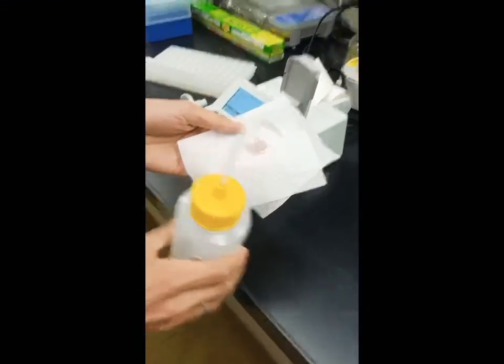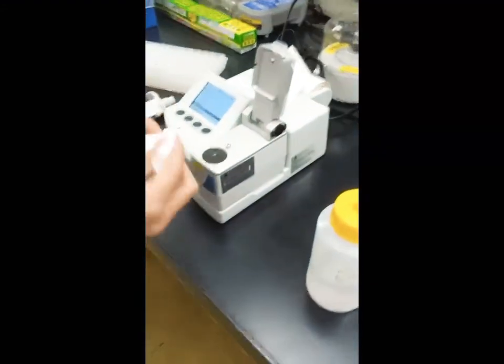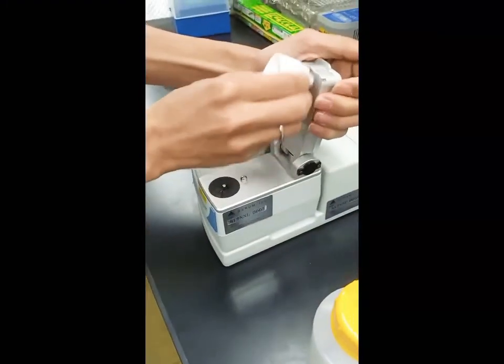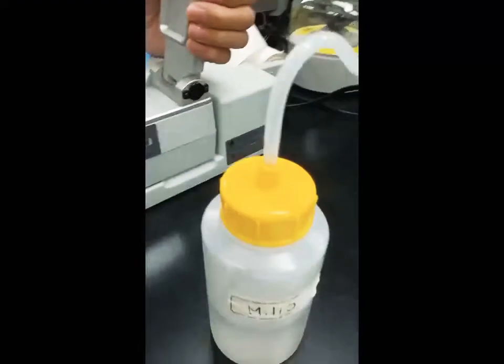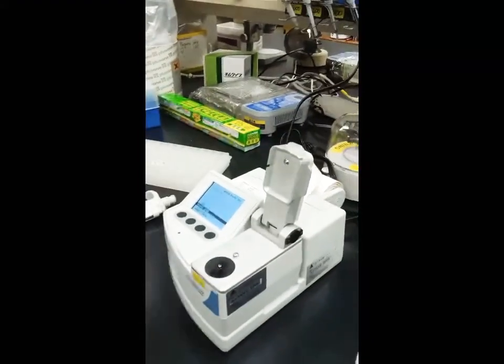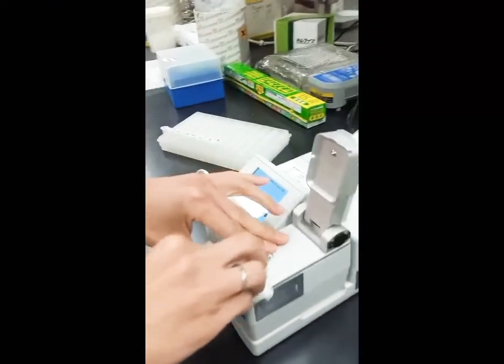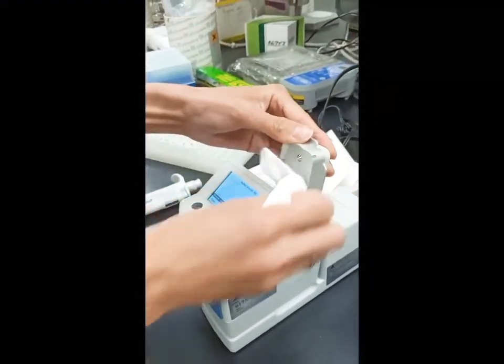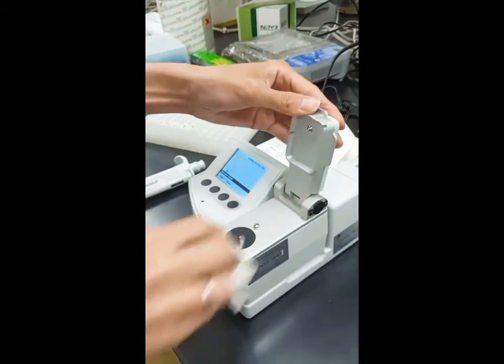We need to clean it up here using DDW — distilled water. That is the sensor, and it's very sensitive, so we need to clean it carefully.